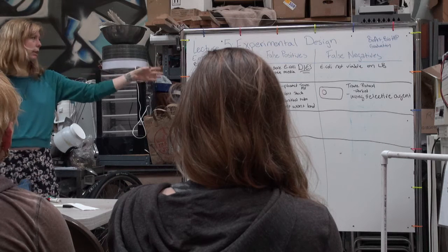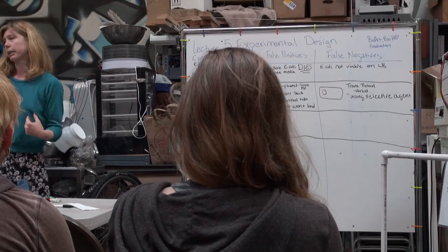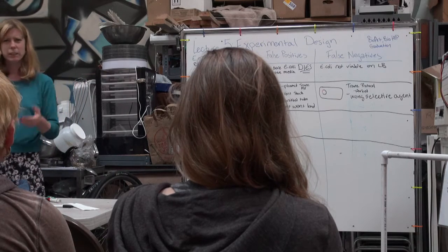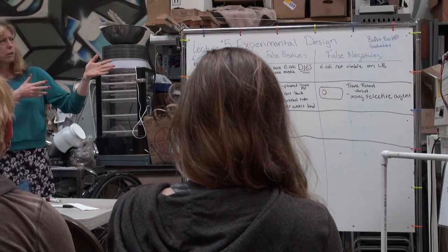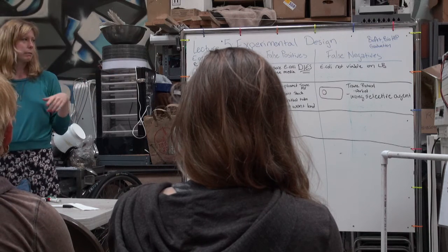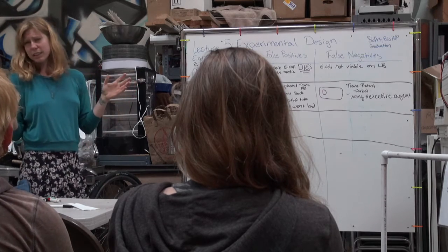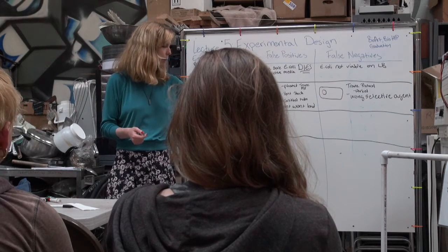Take that sequence and put it in E. coli, it's likely going to work. It's at least going to read for the protein that we're after. So we'll have to do a little bit of RNA extraction, freshly, just RNA extraction right there. Then do reverse transcriptase PCR, right? Extract it out, make some DNA copies, probably send it off for sequencing to make sure. Yeah, get that sequence, and then we're going to be plopping that into our vector.